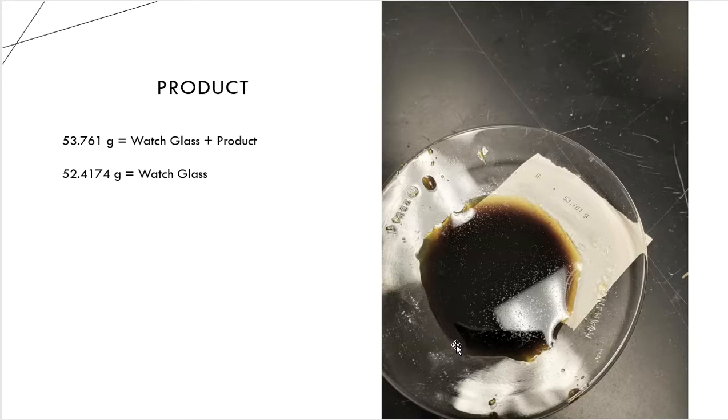So what you're seeing on the screen is a mass, and that mass says, actually up there if you can read it, 53.761. That is the mass of the laboratory technician when she decided to look and monitor and measure that product. So up here to the top left, you're seeing the 53.761, and that is the watch glass and the product that she ended up with, and then 52.4174, which was just the mass of the watch glass on its own.